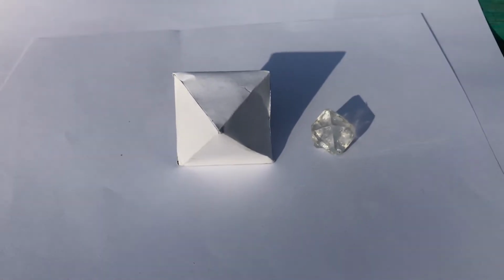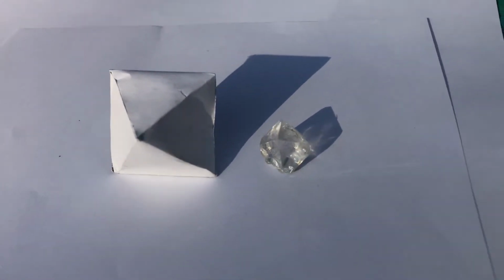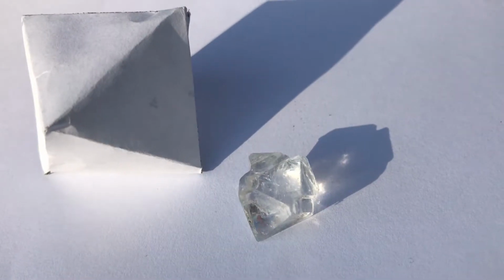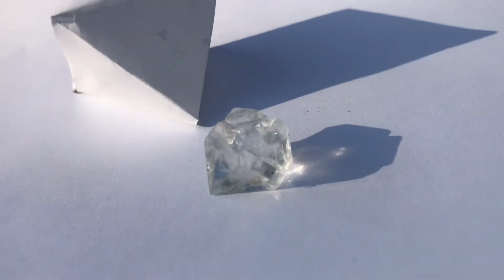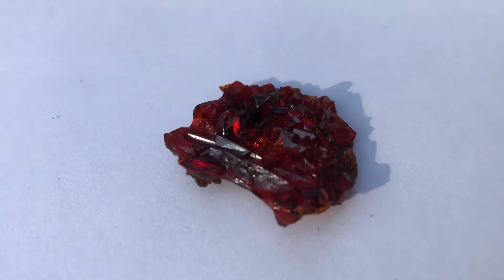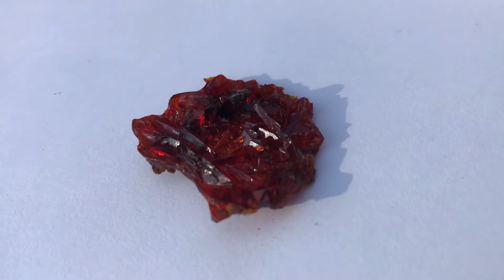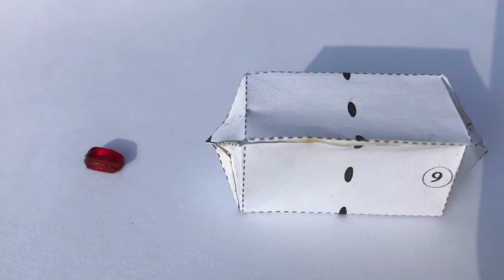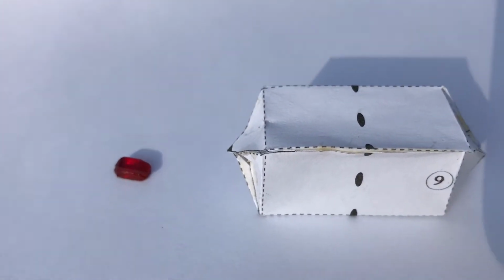For every crystallohydrate, I have made an origami shape that represents how the geometrical form of the crystal should be. I also make comparisons between my crystal and the shapes. For the hexacyanoferrate 3 is the tetragonal system, dipyramidal class, and the form of a dipyramid or a prism.